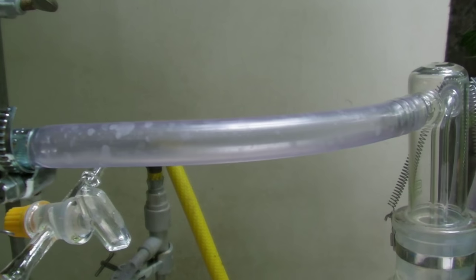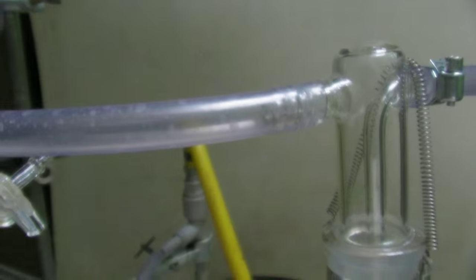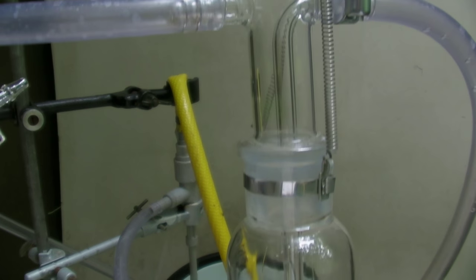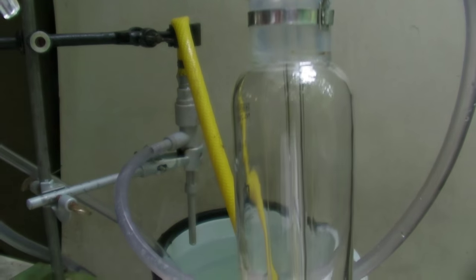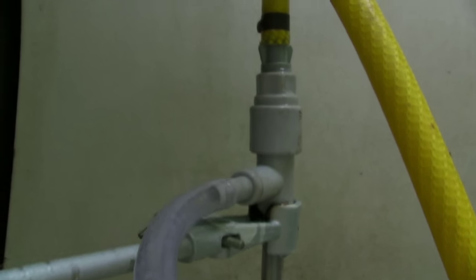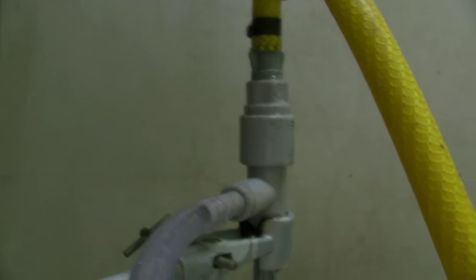A gas washing flask is connected to the vacuum stopper because a water jet pump is used for lowering the pressure. If the flask would be left away, water could be sucked into the apparatus. The water jet pump is connected directly to the water pipe. Today the use of membrane pumps is preferred, but these are also way more expensive.